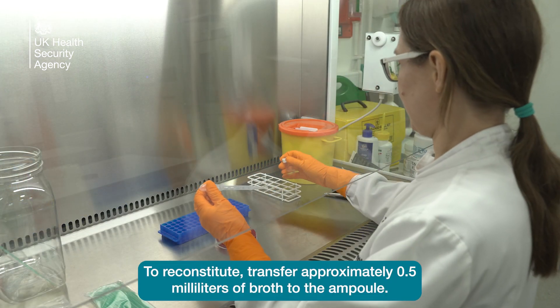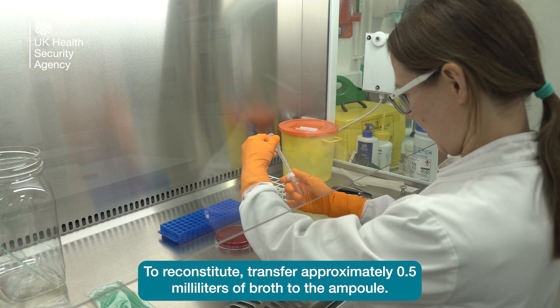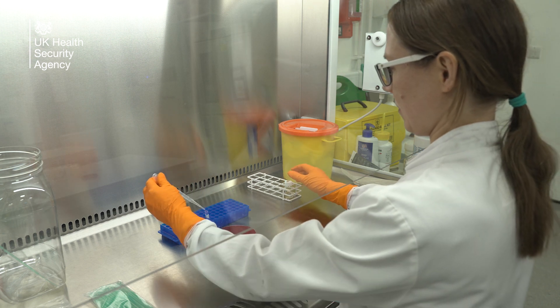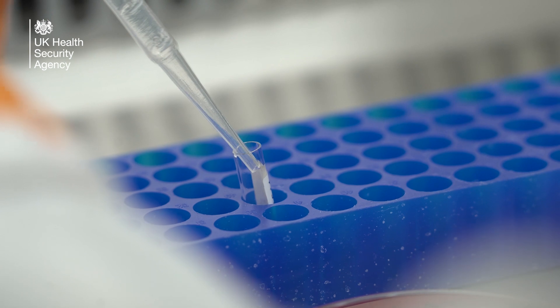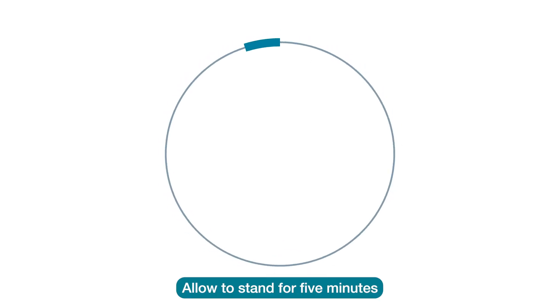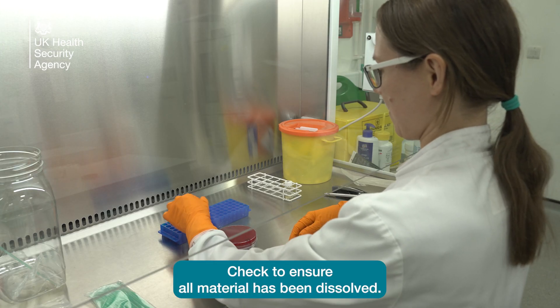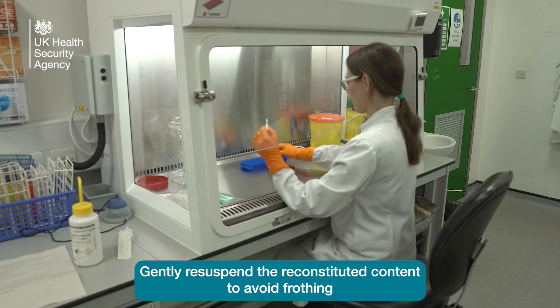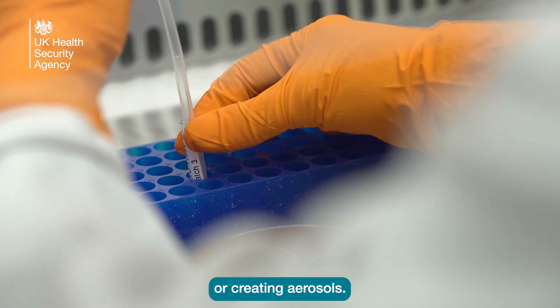To reconstitute, transfer approximately 0.5 millilitres of broth to the ampoule, enriched with blood if required. Allow to stand for 5 minutes to ensure that the content has rehydrated. Check to ensure all material has been dissolved. Gently re-suspend the reconstituted content to avoid frothing or creating aerosols.